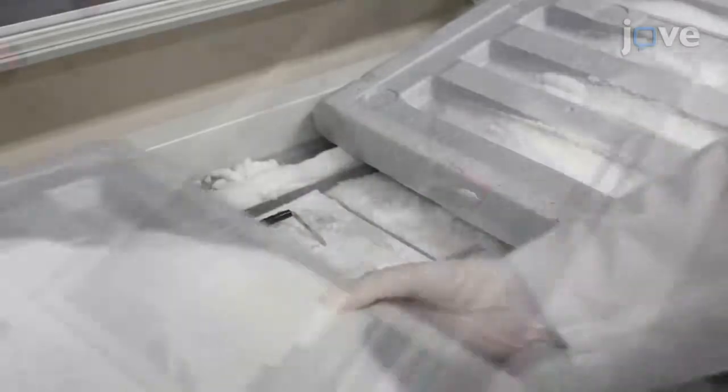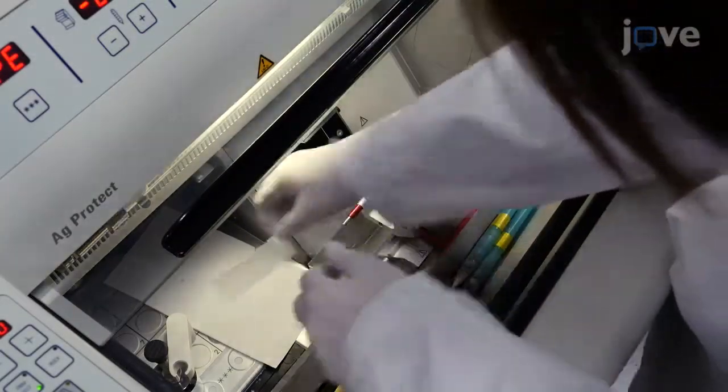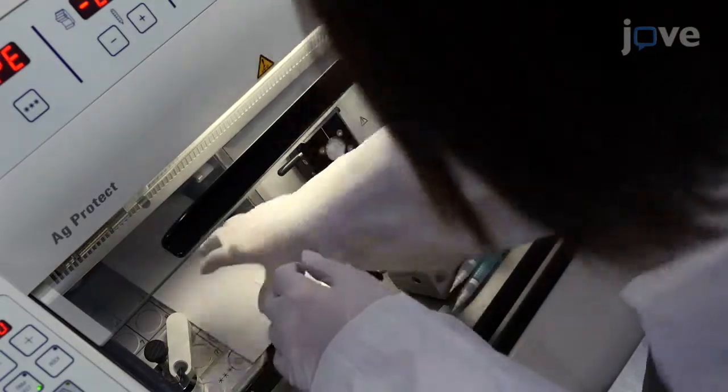To cut the tissue sections on a cryostat, first place conductive indium tin oxide, or ITO, coated microscope glass slides inside the cryostat.